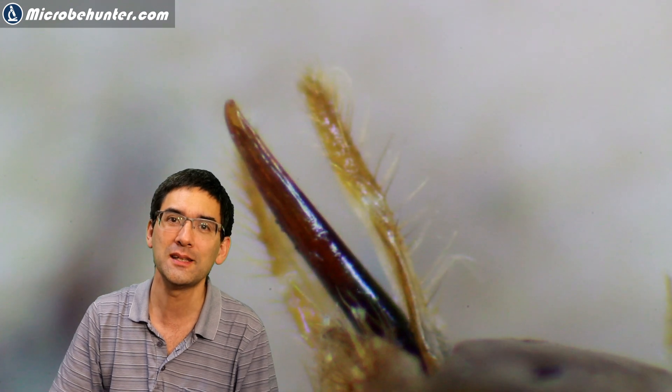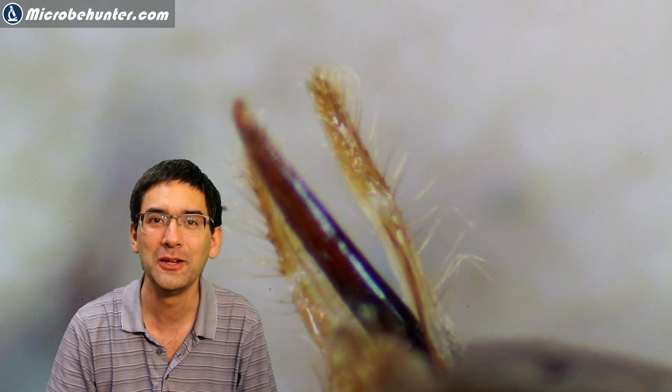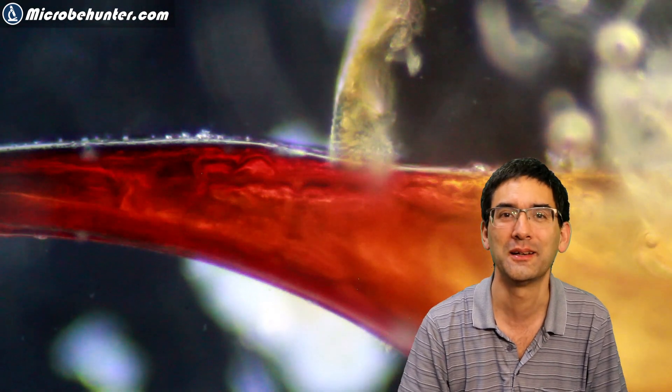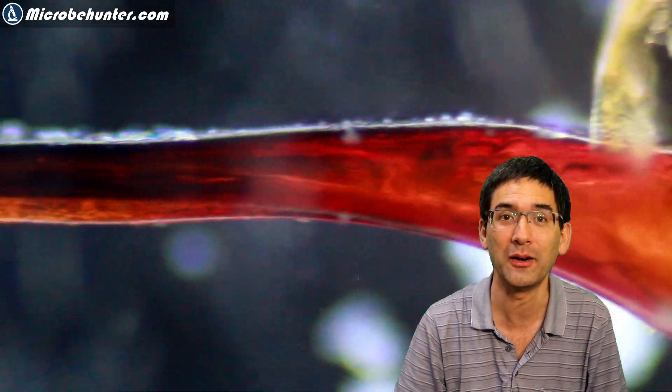What I've done next is I decided to look at everything here under the compound microscope. And here what we see is a dark field image of the stinger. Yeah, looks quite nice as well, of course.